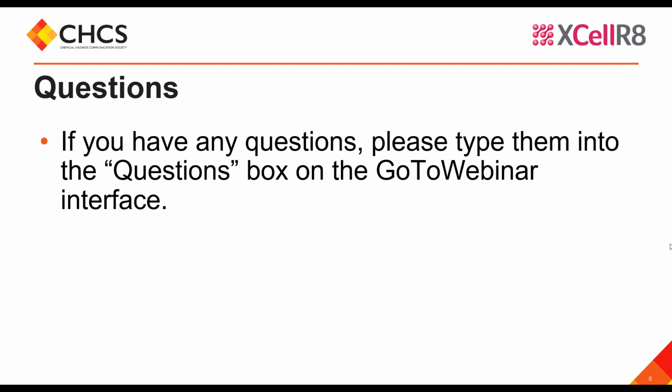I would just point out that all of the formal validation studies for any of these methods were originally done using single chemicals, not mixtures. And so that is a thing across the board. But the OECD expert working groups, when they're reviewing the data, they do also make an assessment on whether they feel that they can say that it's suitable for mixtures. And for all of these methods, the test guidelines say that they are.